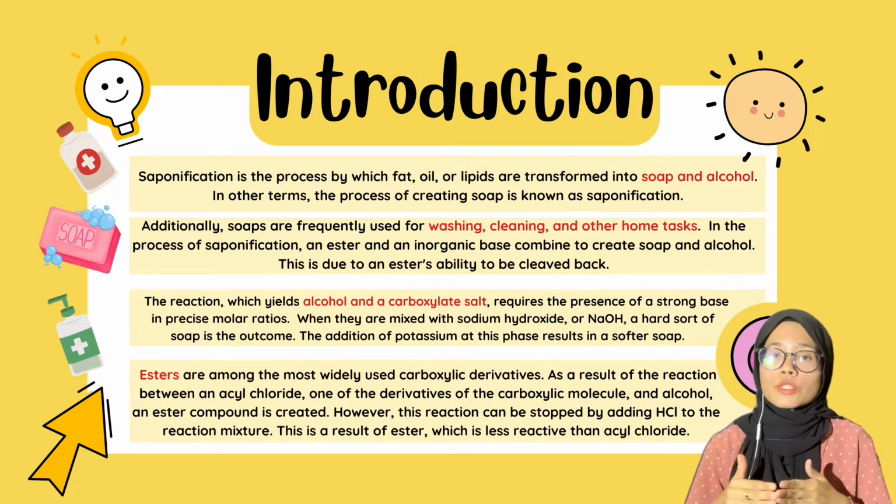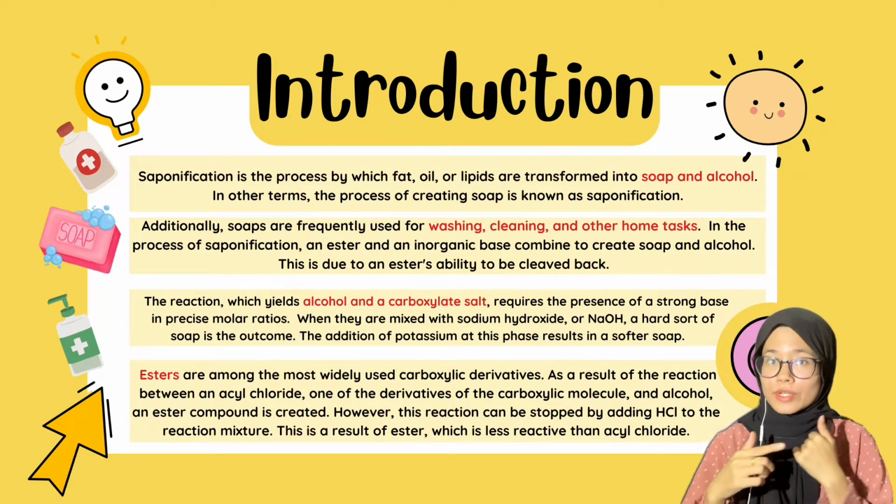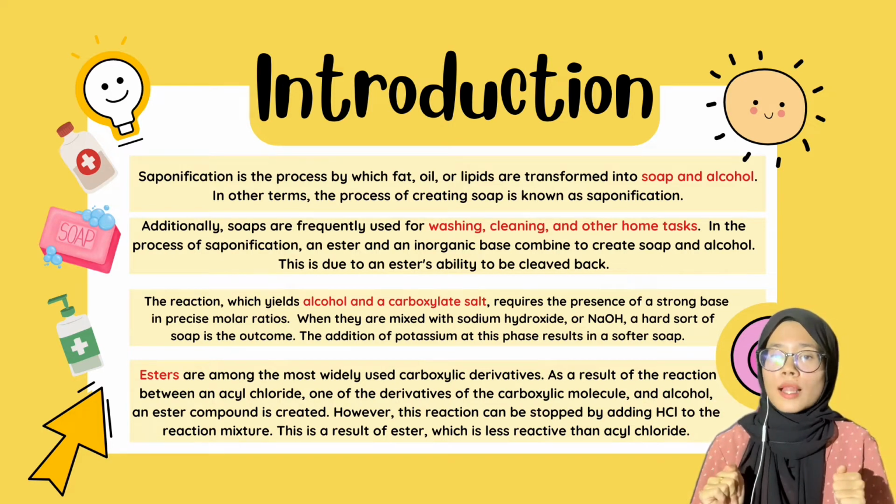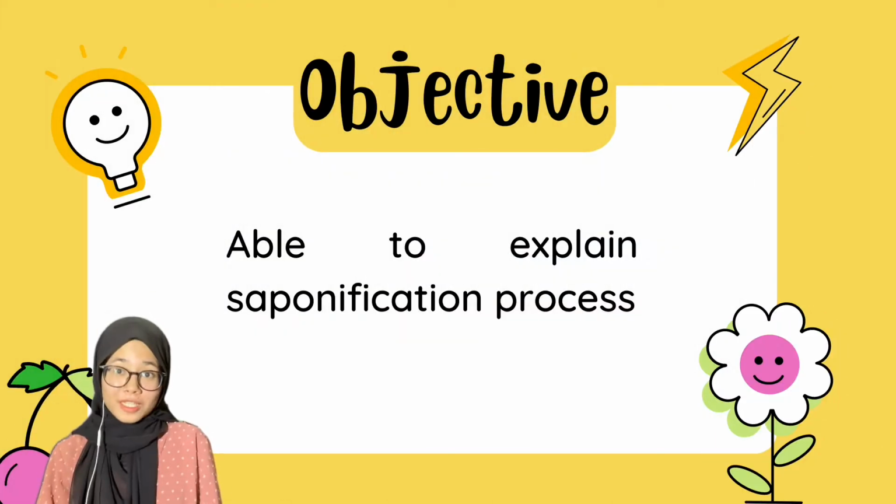Soap is required to remove oil and debris from surfaces, including the surface of our skin. In addition, soaps are widely used for household chores like cleaning and laundry. Objective: to be able to explain the saponification process.